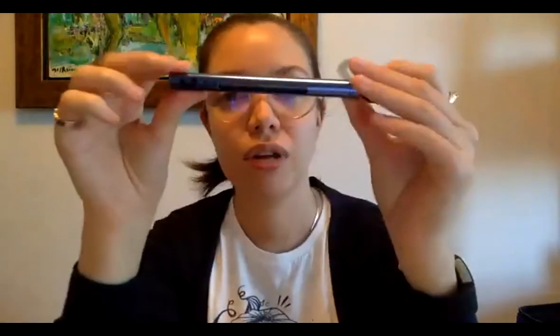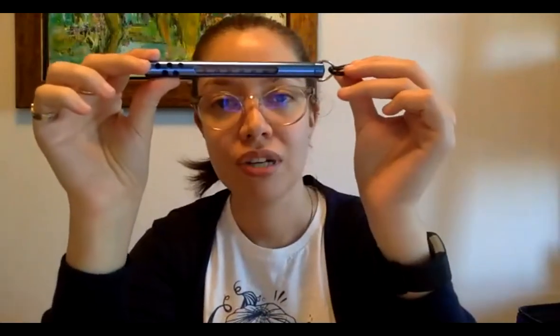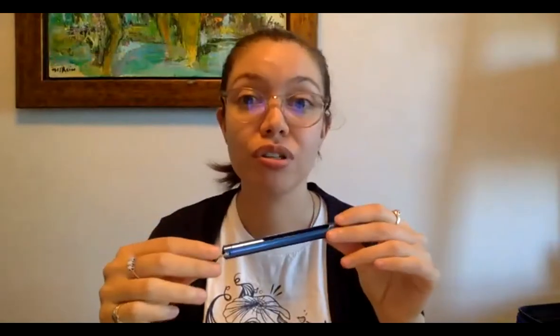Actually, before you take your sample, the first thing to do is to go measure the air temperature. And you have this little air thermometer in your test kit. We usually recommend people hang it in a tree or in a shaded area. Just don't put it around your neck or anything, because your body temperature is going to affect your reading.